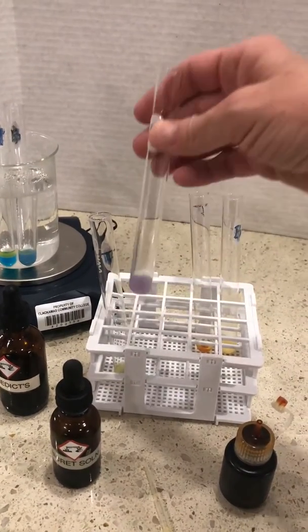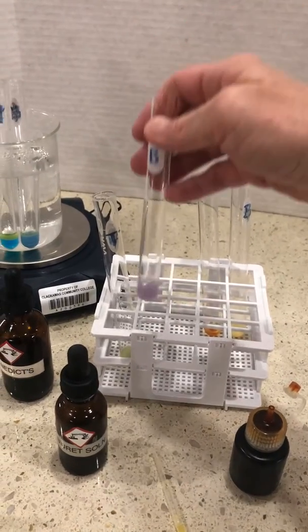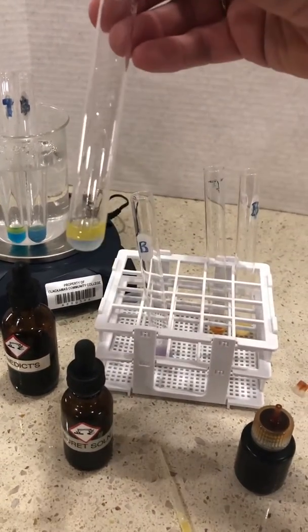In our biuret, notice the bottom layer, a much more distinct violet color, and here's the top layer.